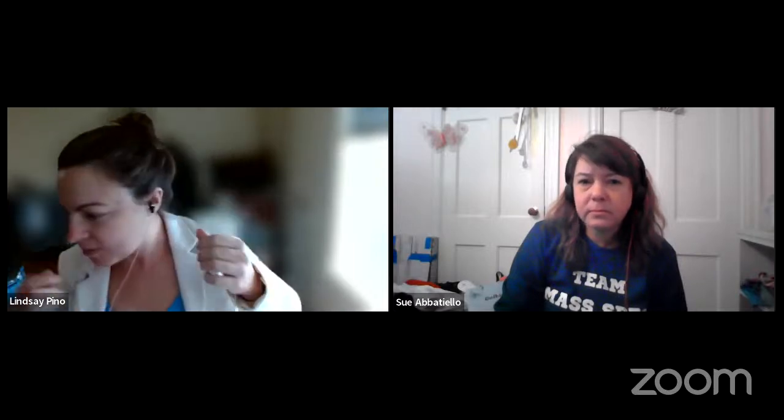So maybe since we're taking a break, I can ask a couple of questions. Yeah, of course. So I am moderately familiar with Skyline, but I've always been kind of confused by the verbiage. So maybe you could just help me understand, when you say transition, what is a transition? You want me to do this? You can do it. I learned it from you. It only seems appropriate. Let me see if I might have a slide that.